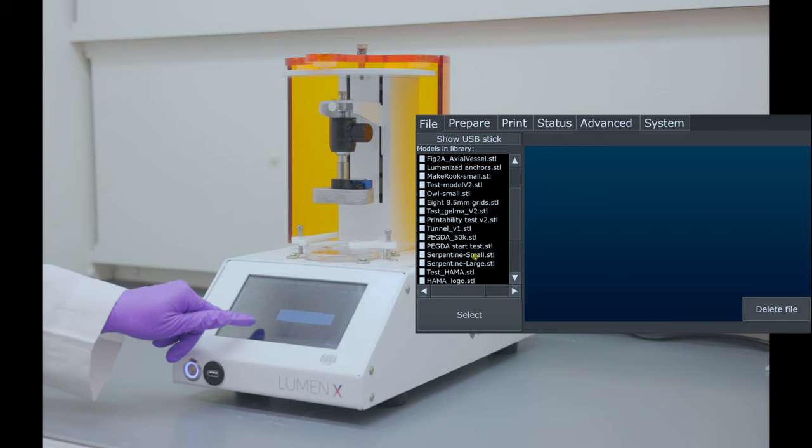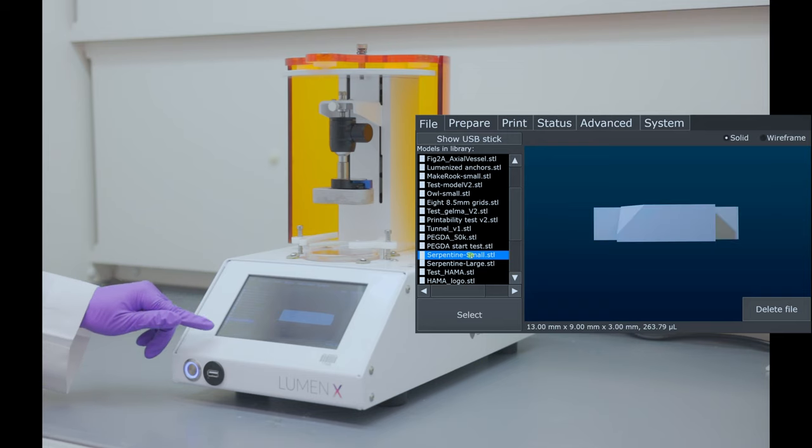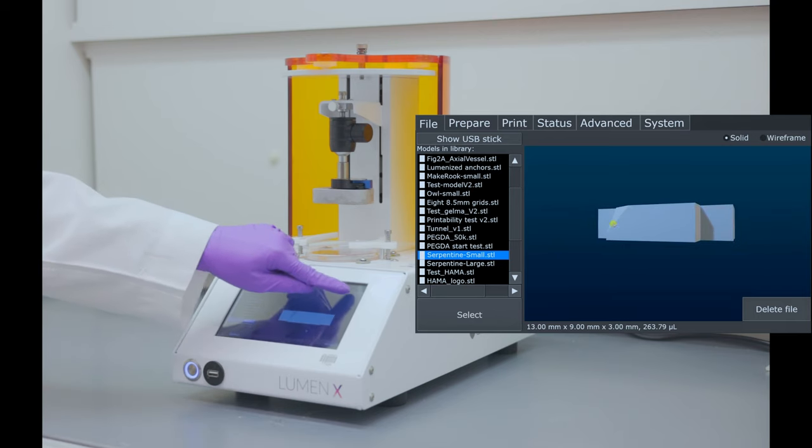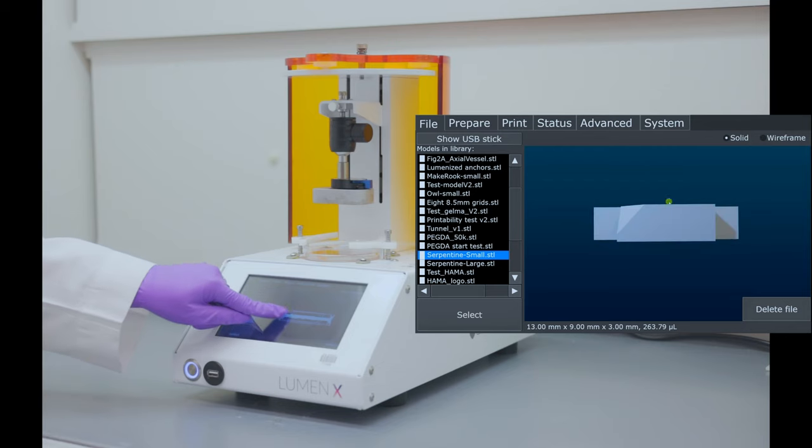Today, we will be printing a serpentine small model. Tap on the file and the 3D model can be seen here on the screen. We can turn it around. We can check the wireframe mode to look at the model in wireframe and to look at the internal structure of the model.